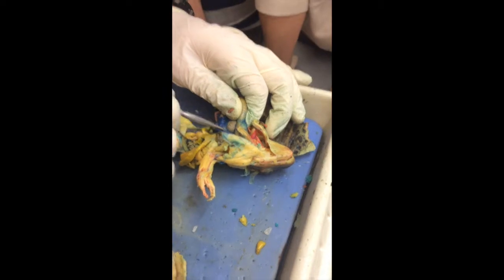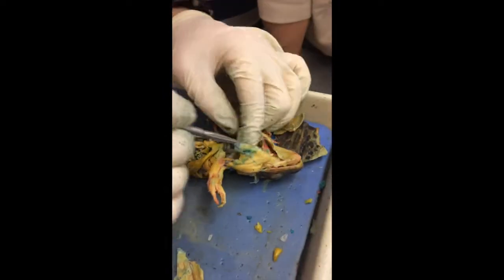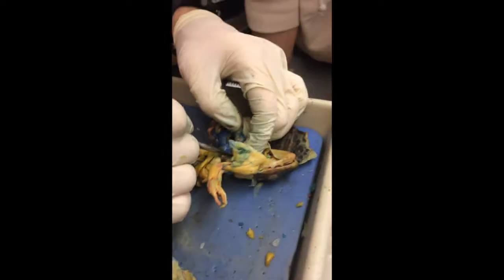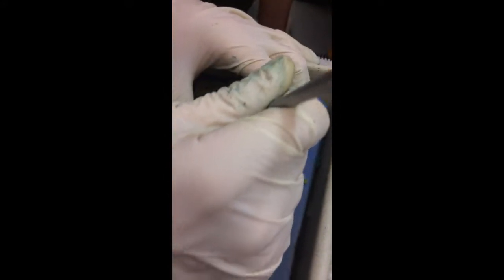That's totally wrong. I'm sitting here looking at this and I'm like, no, that's not the heart. What did you call it? That was the esophagus. That's the heart, that pink thing. This is the heart. These are the lungs, and this is the esophagus.